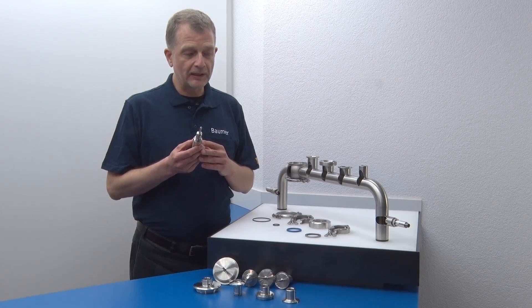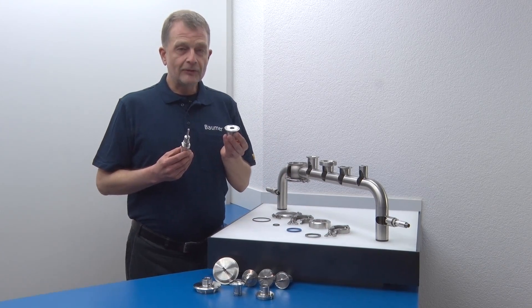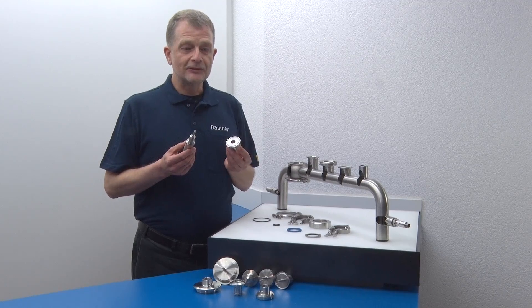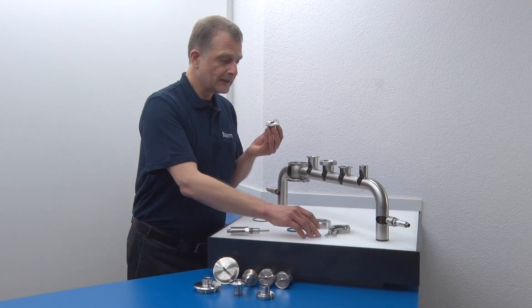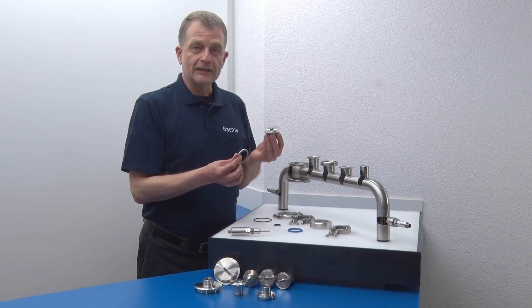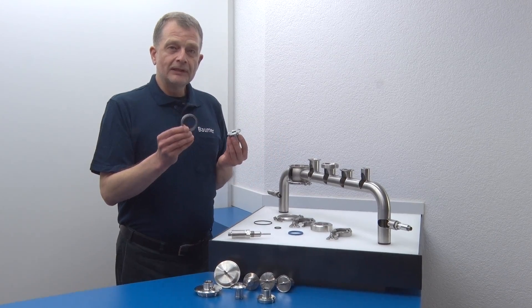Adapters are the solution. With the help of an adapter, Half-Inch Hygienic Connections are compatible with clamp connections. Here, we need a seal. This is a specialized seal with EH-EDG certification.